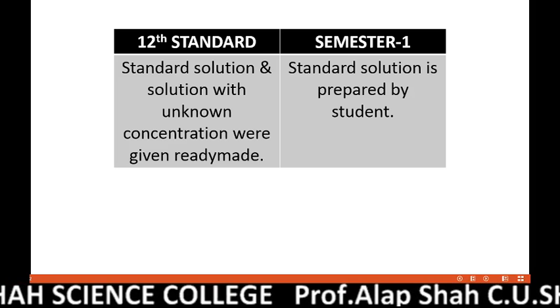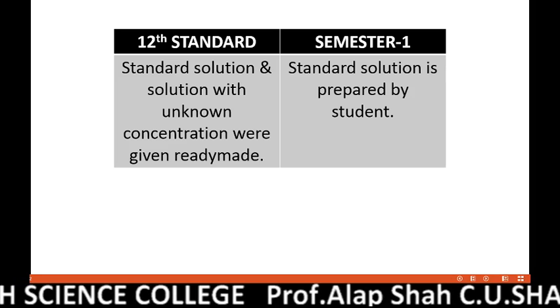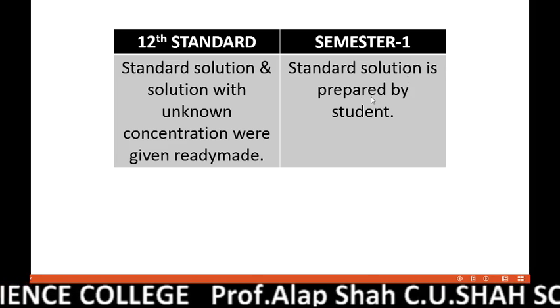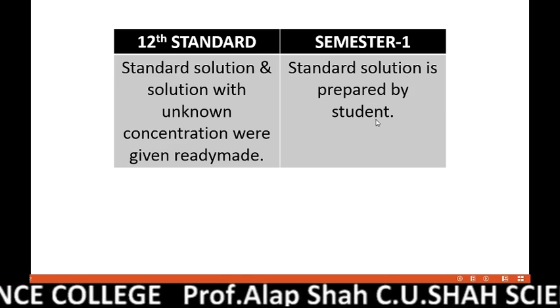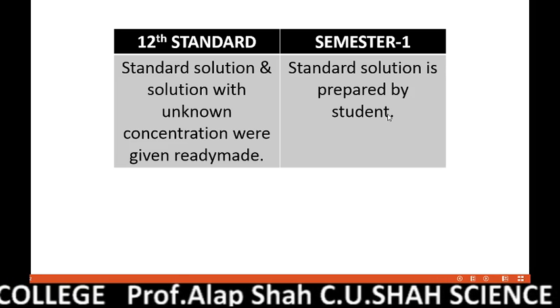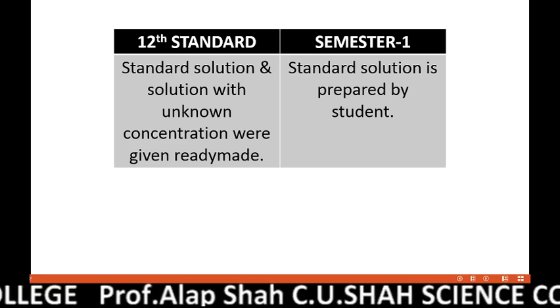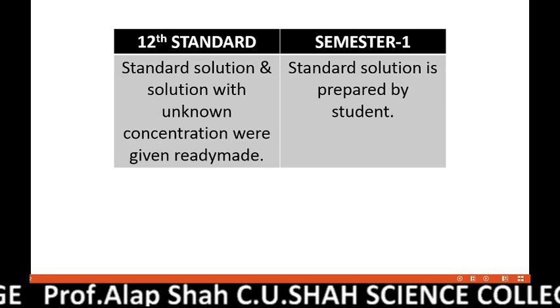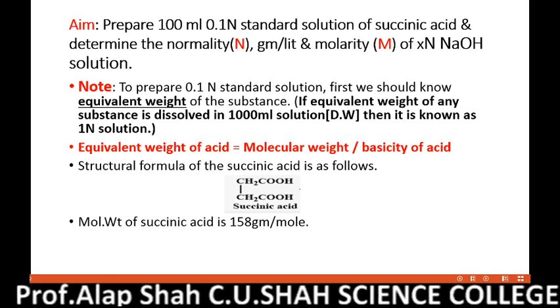Here in semester 1 at college level, the only difference is that the standard solution you have to prepare on your own, and you will be given the unknown solution. So that is the new part. That's why in this first presentation we will discuss how to prepare a standard solution.